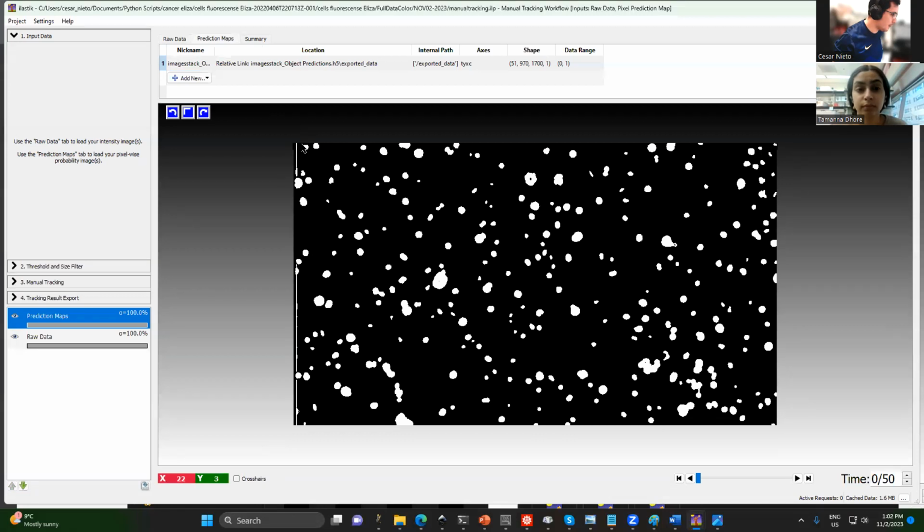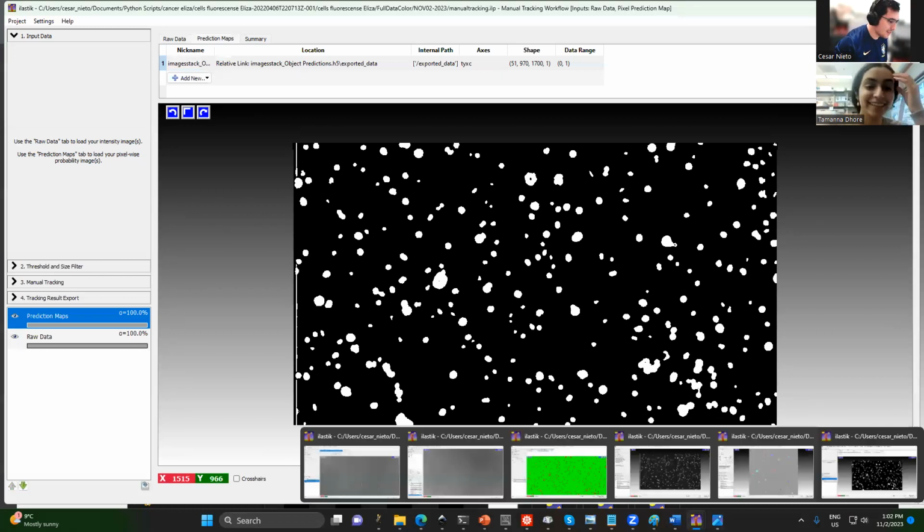Here in this corner is 0, 0. But here is the opposite: Y is vertical and X is horizontal. But for instance, in Python, Y is horizontal and X is vertical. That's confusing. It's something that you have to check. Okay, so I think if everything was fine, you can do it yourself.